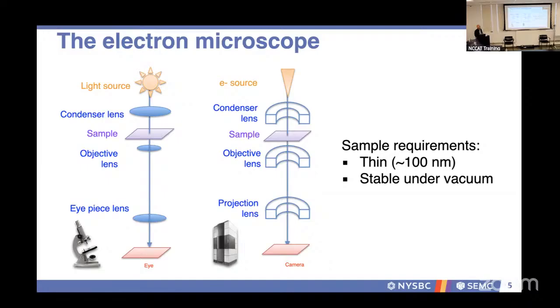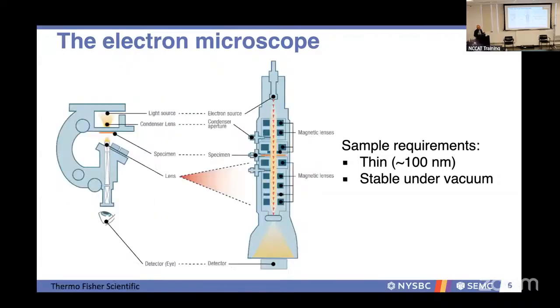There are some peculiarities that I'll get into tomorrow morning about the electron microscope, but we also need that sample to be stable under vacuum. And another way of thinking about that is if we literally inverted a microscope and you compared the lens system, the electron sources, you'll see that it very much goes 1-to-1. So if you're thinking about that, then we have to prepare a biological sample that's amenable for EM analysis.